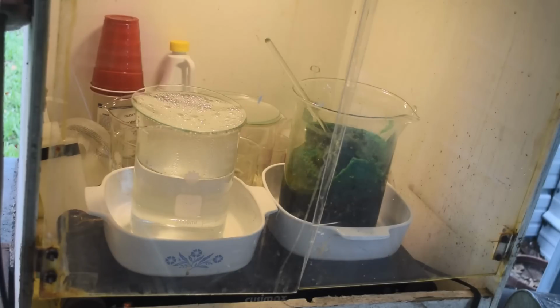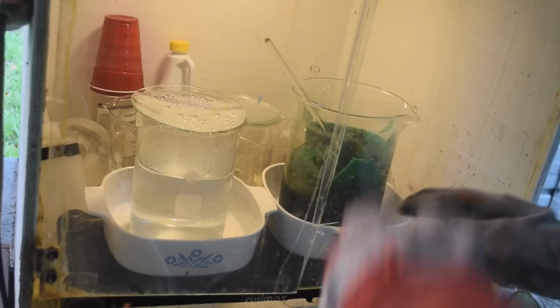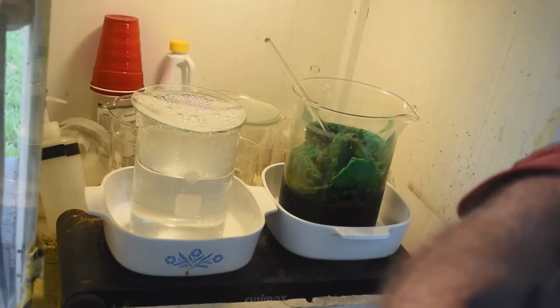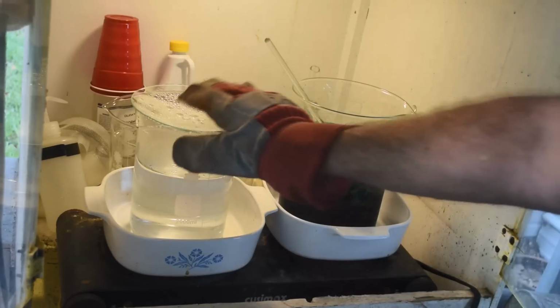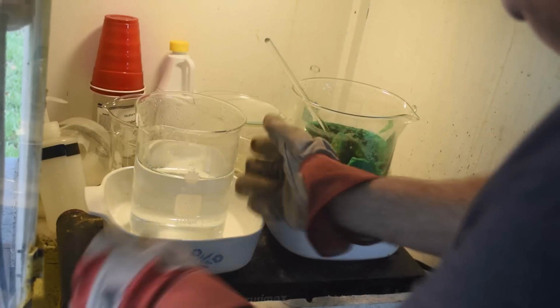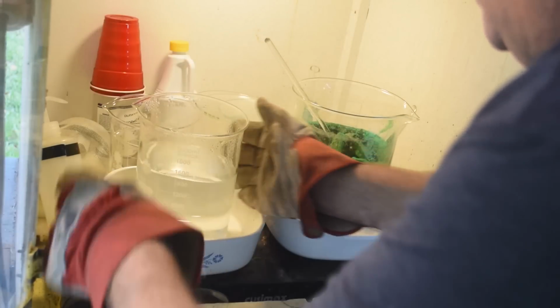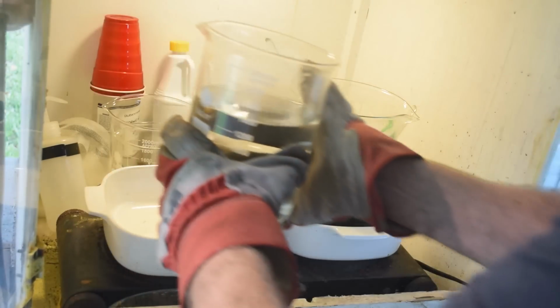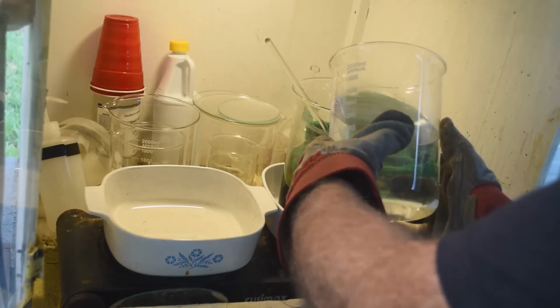All right, so I've got some hot water here. It is just below boiling. This is distilled water, by the way. And I am going to pour it over the solids in here. I want to try to at least partially dissolve them before trying to heat. Let me turn the heater off, speaking of that. Before trying to heat this beaker from the bottom so I don't break another one.